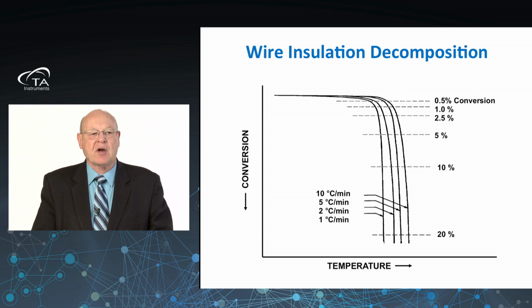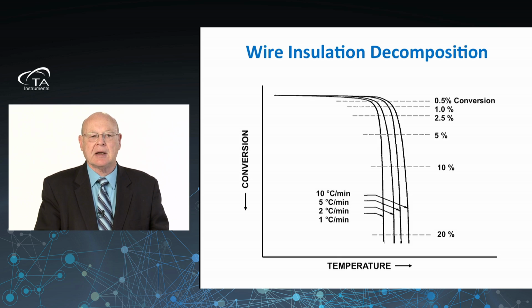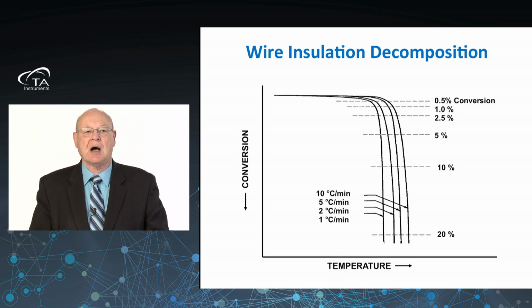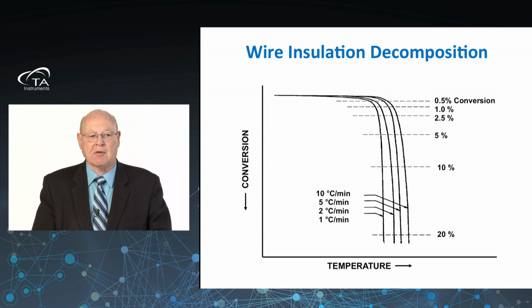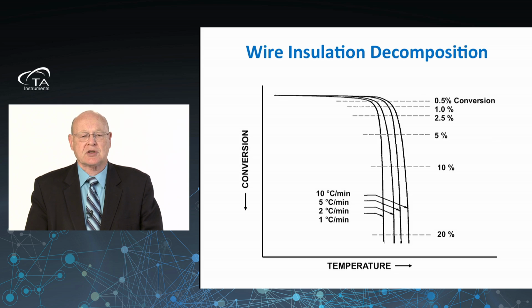Now, in thermogravimetric analysis work, we look at mass loss. And we have the same profile here for the variable heating rate methods that we saw in differential scanning calorimetry. That is, the reaction rate moves to a higher temperature as a function of heating rate. The curve on the right-hand side here reflects this decomposition at 10 degrees C per minute, while the one on the left corresponds to 1 degree C per minute. As was the case in DSC, we select a point of constant conversion. In kinetics by TGA, this is usually about 5% mass loss.